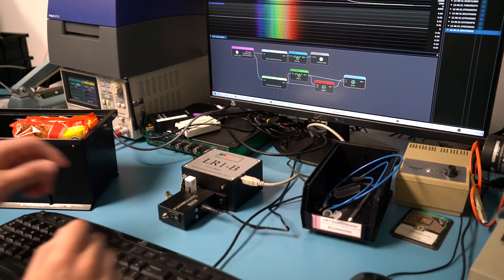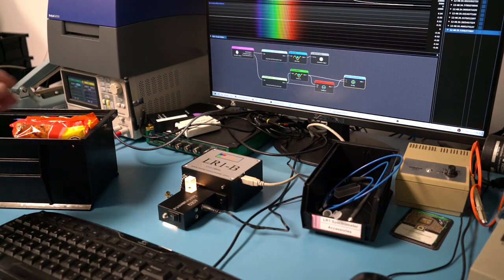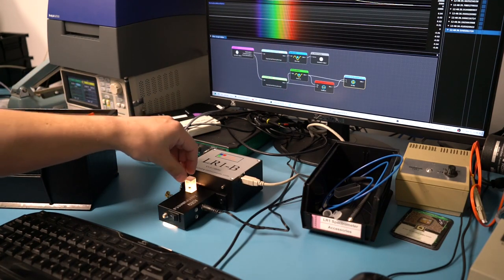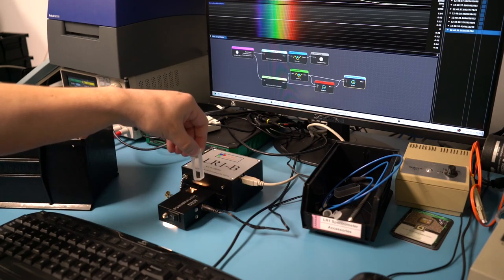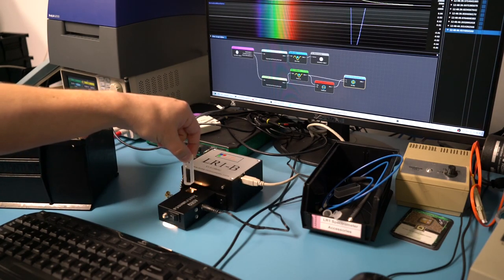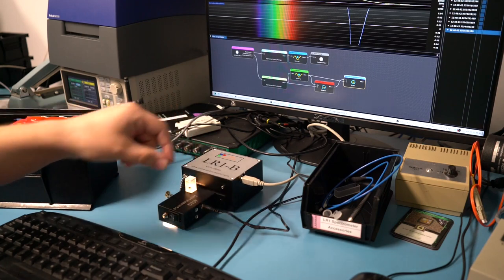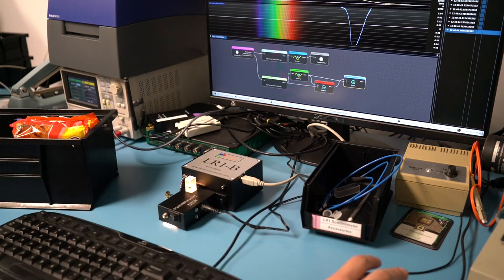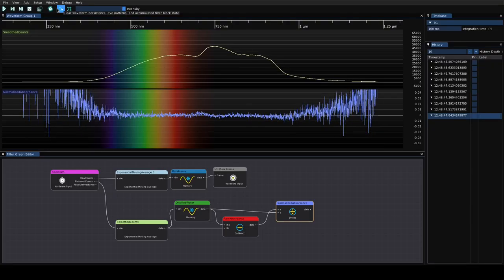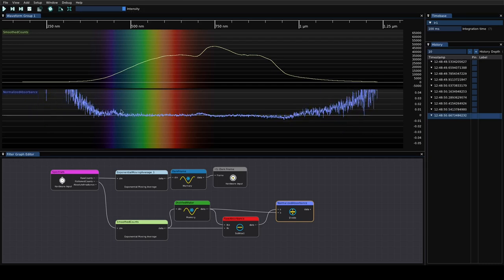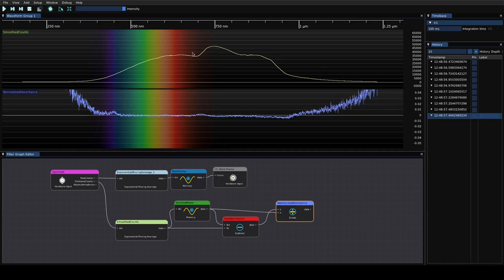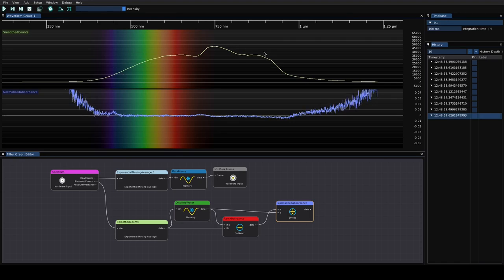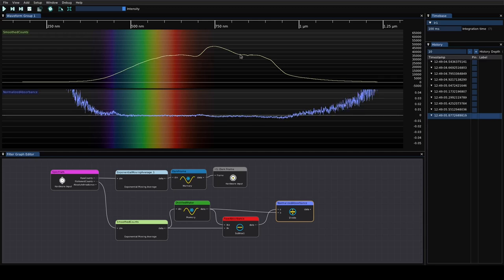For our initial test we're going to turn on our halogen lamp. You can see we've already got a quartz cuvette in here that's loaded with some distilled water to give us an absorbance baseline. We're just going to clear the old waveforms. You can see we've got some averaging going on to improve the SNR.